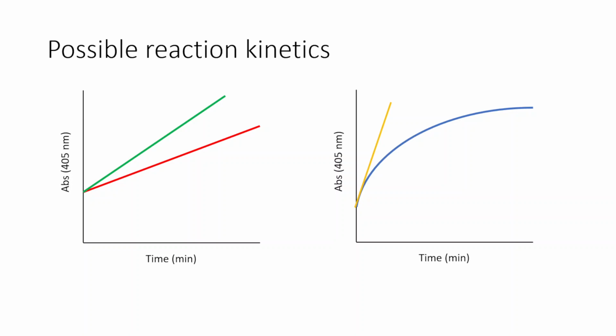During some of your samples, you might see a line that has a different y-intercept than some of your other ones. This is also perfectly fine. As I've been saying, what we're measuring here is the slope of each line. The y-intercept is less relevant. It's really more of a measurement of how much initial substrate and product you have in that cuvette. It's not measuring the rate of the reaction. Again, the rate of the reaction is the slope of the line.